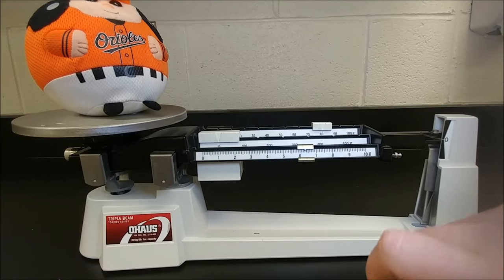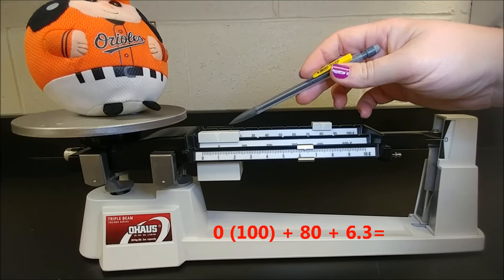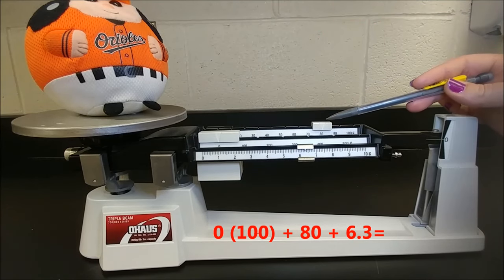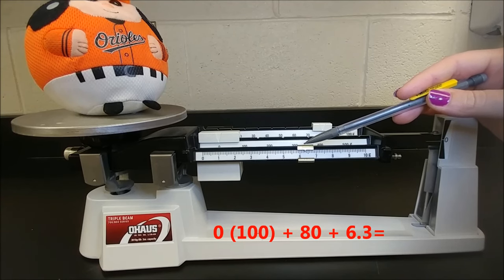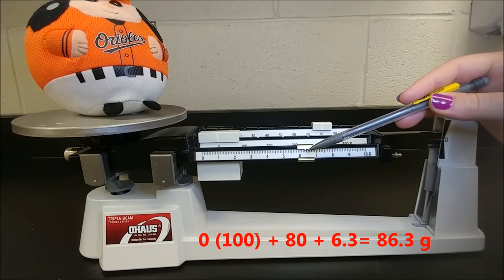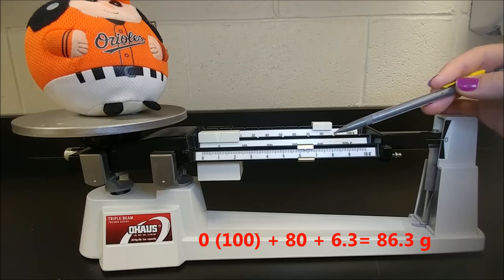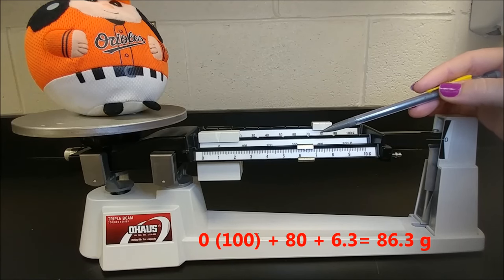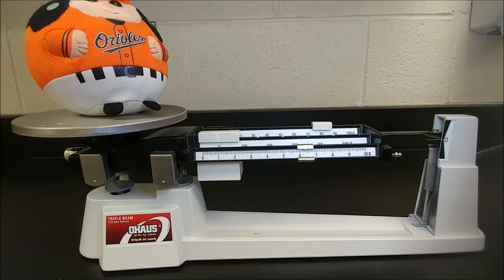And just like that, it's in a line. You can see the line of the arm lines up perfectly with the zero. So we have zero hundreds plus 80 grams plus 6.3. That means zero plus 80 plus 6.3, or 86.3 grams, is how much mass is in that Oriole bird.